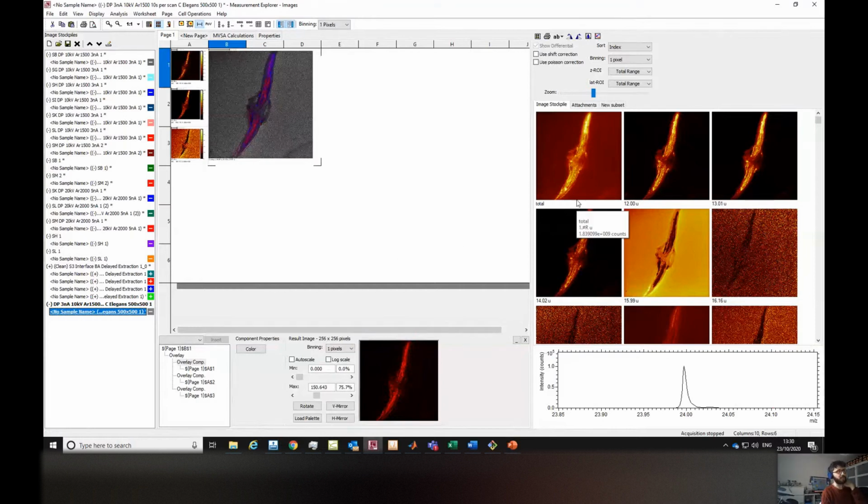So now, as I say, obviously we could exploit this in 3D like we did before, right? We could process every single voxel, which is a huge data set, and it's full of noise as well because the counts per pixel, it's not very intense. So one alternative way is to create, as I say, regions of interest, pull the profiles in those regions, and do this kind of consistent processing of all these profiles.